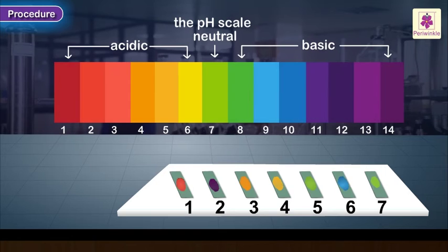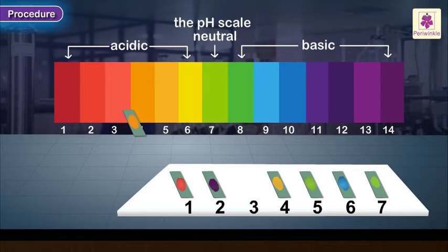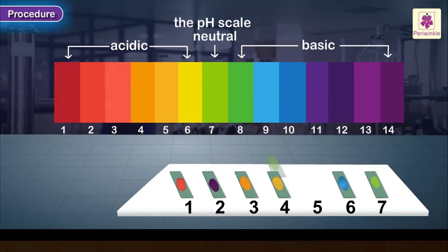Now match the new color spot on each pH paper with the color chart to obtain the pH value of each solution tested.